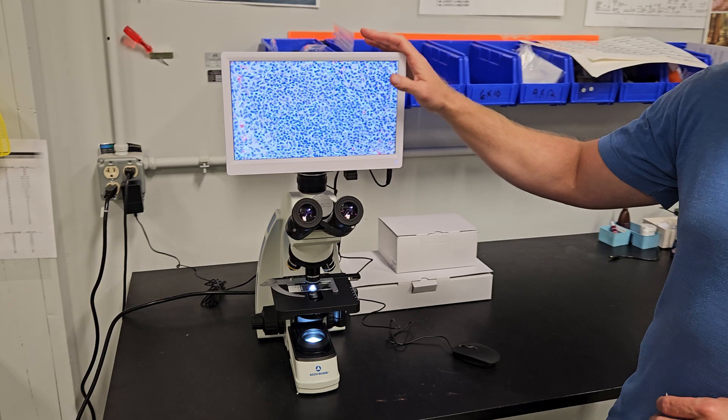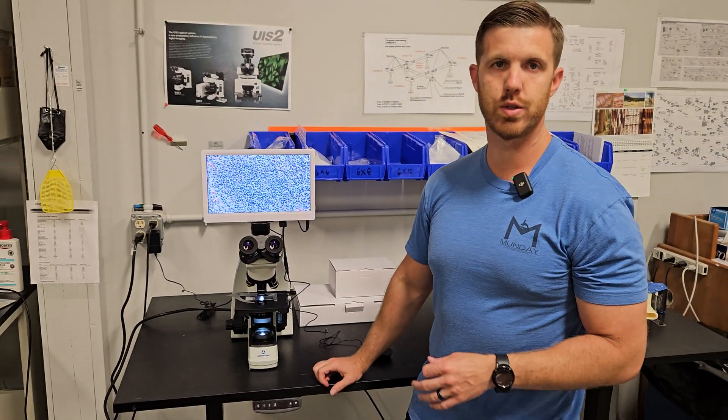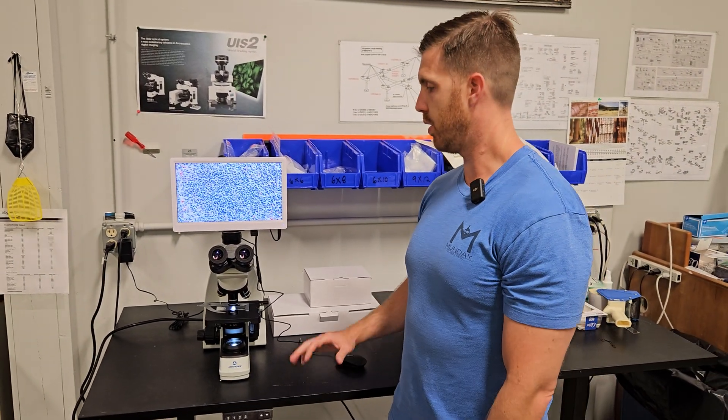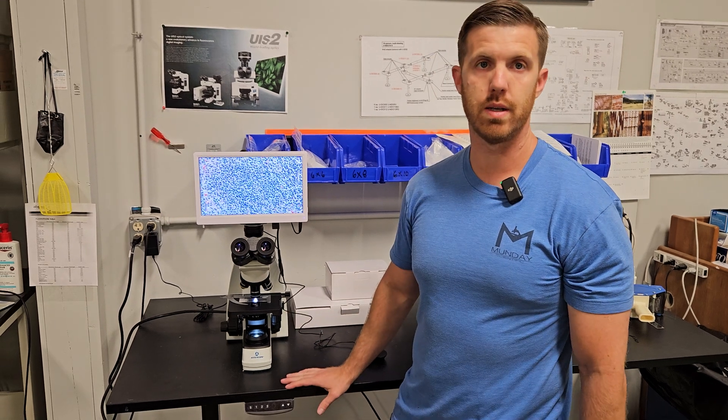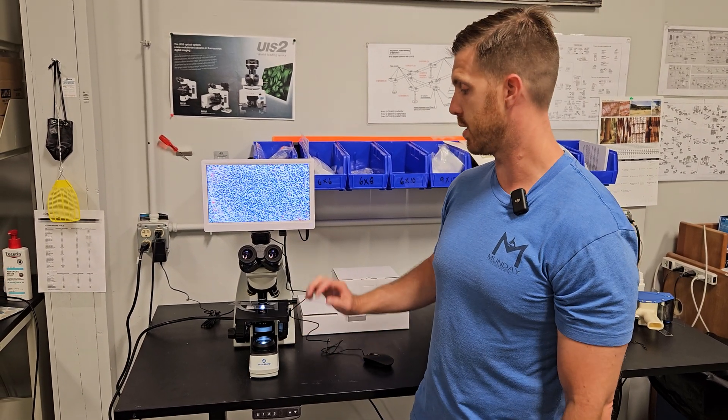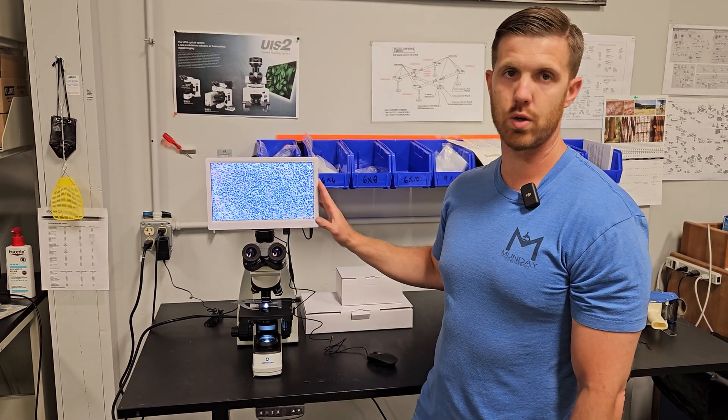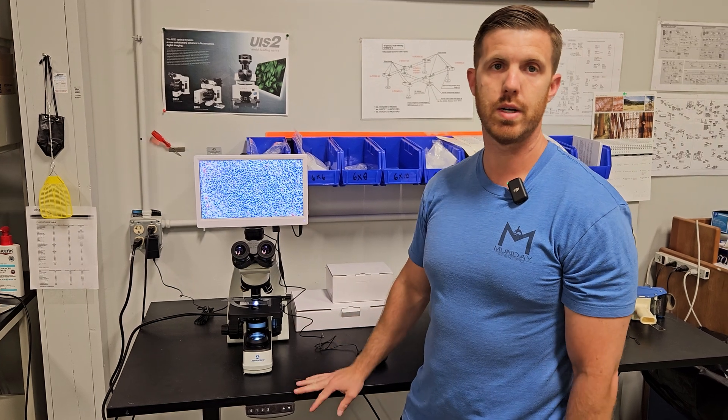This heads-up display can go on any microscope with the trinocular head. So you can use this for an Olympus, a Nikon, Leica, Zeiss, Unitron, AccuScope, any of the brands. This is a great feature and it's not very expensive.